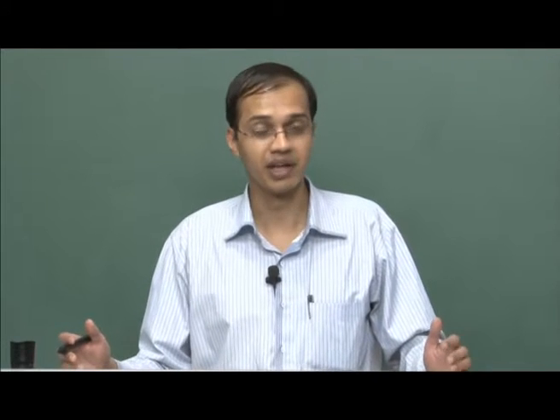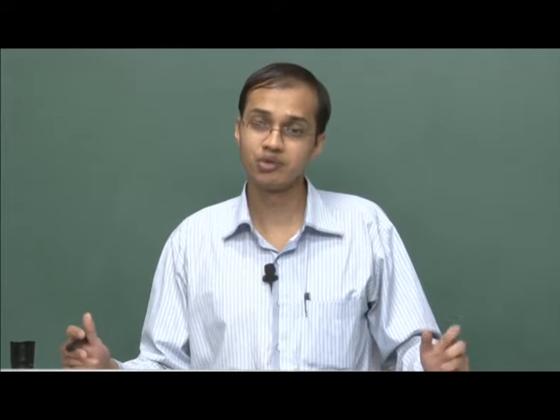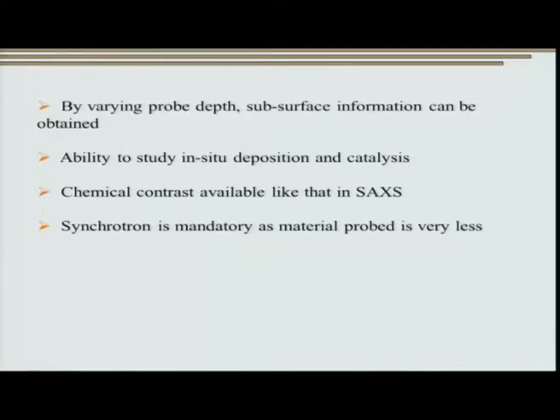At the same time, like we had discussed in the last class, small angle X-ray scattering also provides us, if not directly, in an indirect way, the chemical contrast between different phases. We can also use GISAXS to separate out chemically distinct entities.